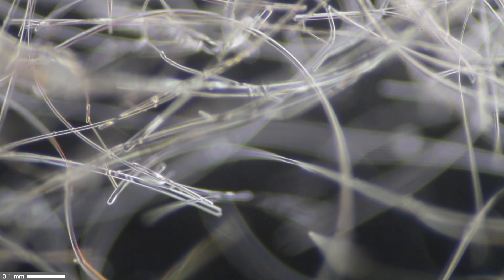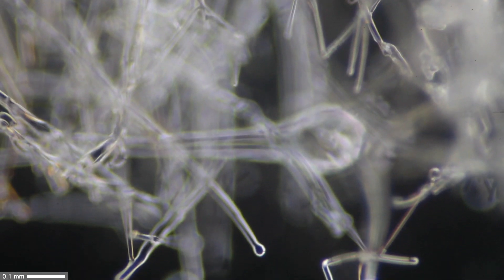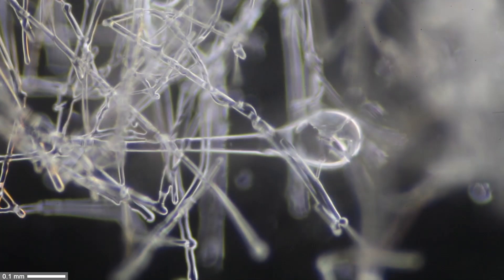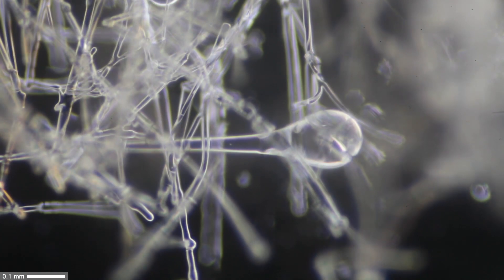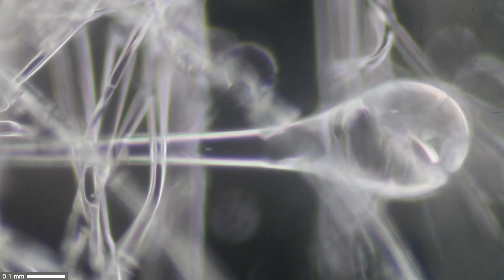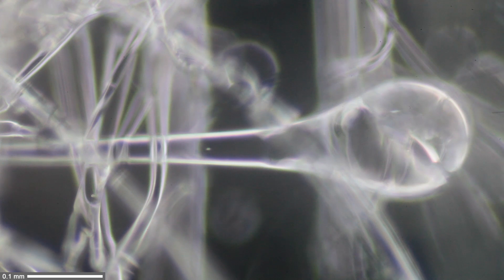The fibers can be seen quite well. They're transparent, it's of course sugar. If you move around a little bit, you can see that some fibers have a bulb-shaped structure at the end. I think this is the place where the sugar was not pulled into fiber completely yet.